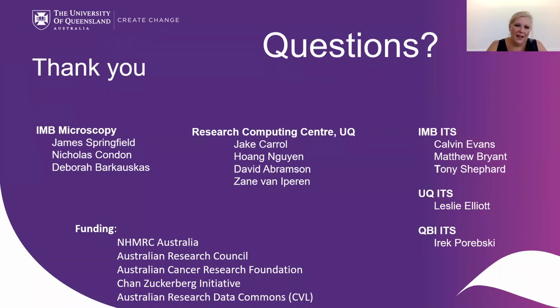Sounds good. We'll ask another question too, which is with those parameters, Nick, that people were inserting into the workflows there, is that information that they would get from the machine, or do they get that from the literature, or how do they come by knowing what they're going to be putting in? Yeah, the pixel size of the camera won't ever change. So that's basically a fixed one that could be locked down. The thing that's going to change is the Z spacing, and therefore when we deskew it, what the voxel size will be after deskew.